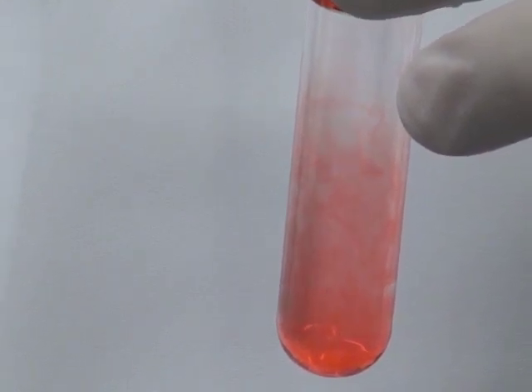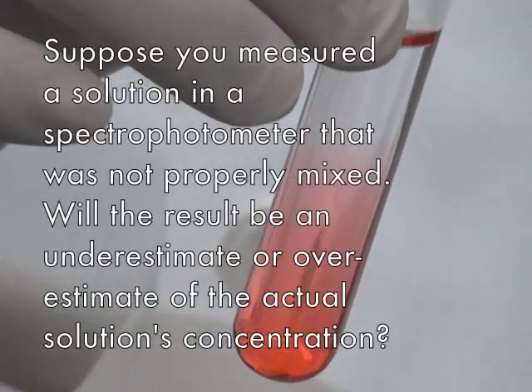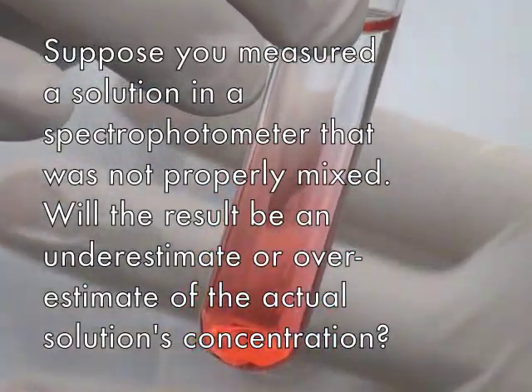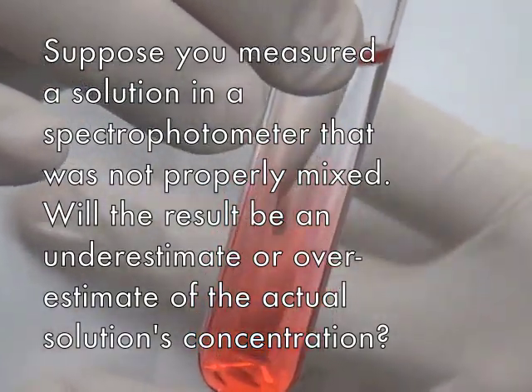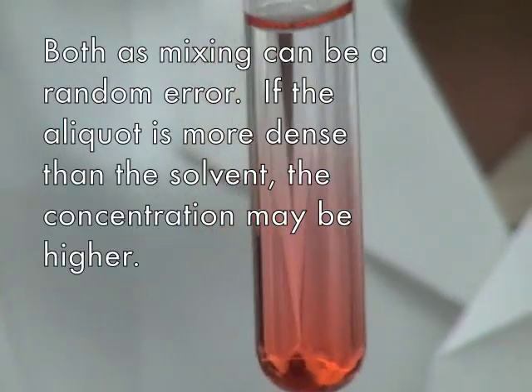A common misconception is that solutes rapidly mix the instant they are added to the solution. Suppose you measured a solution in a spectrophotometer that was not properly mixed — will the result be an underestimate or an overestimate of the actual solution concentration? Possibly both, as this can be a random error.